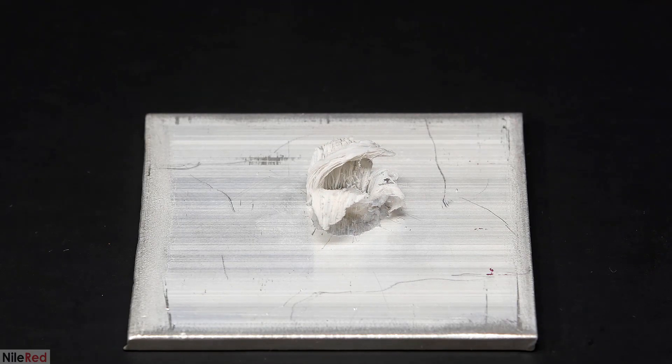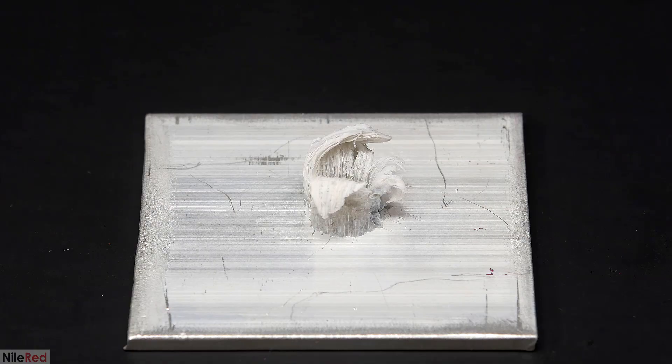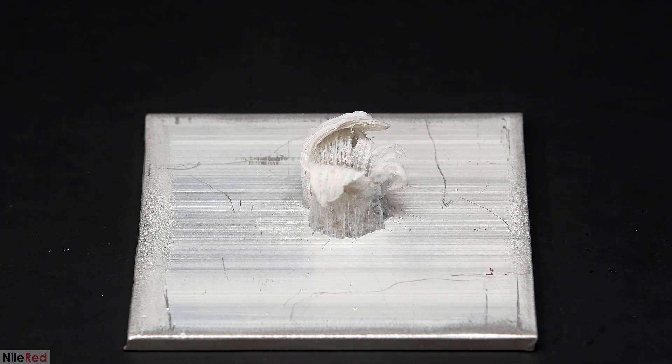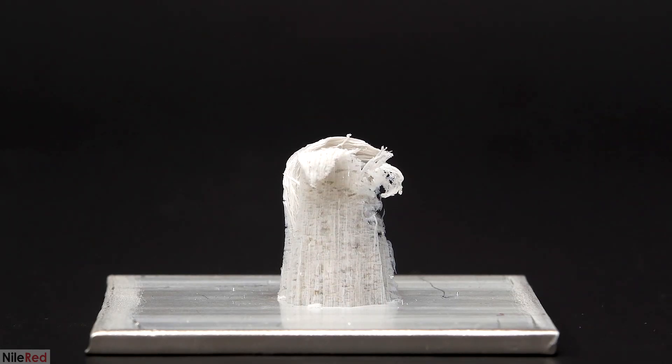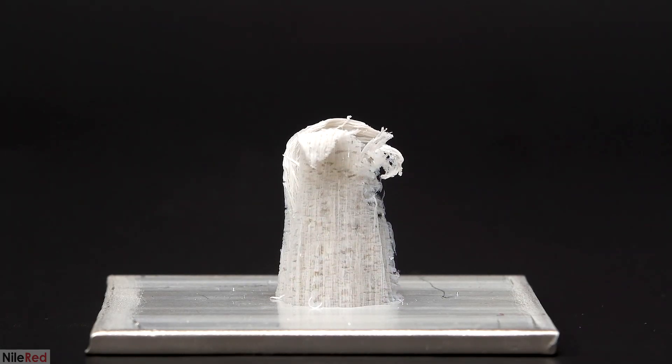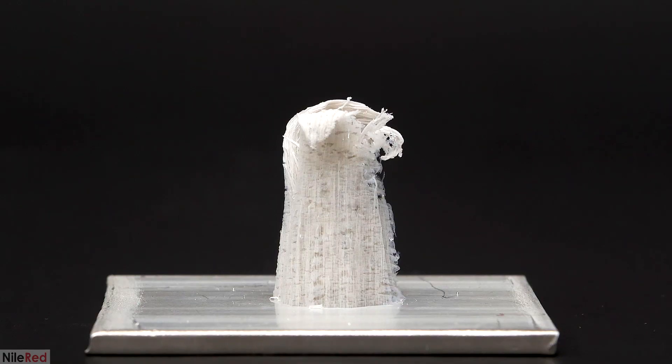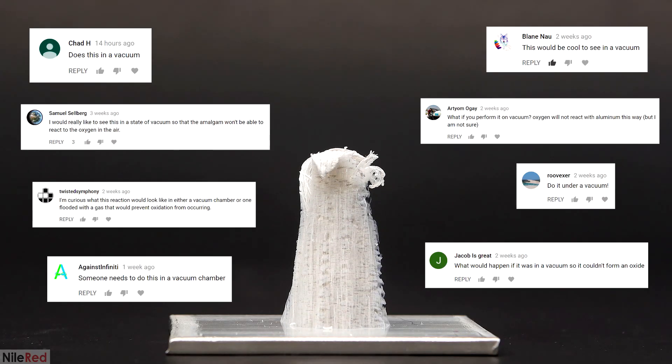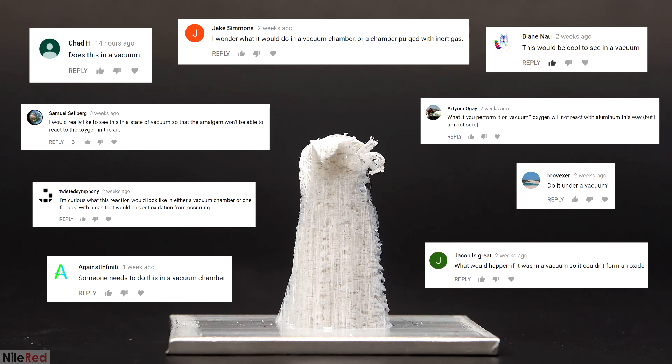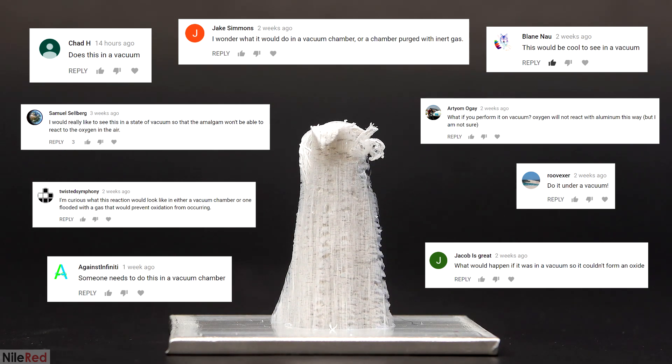Anyway, in the comments of the original video, a lot of you told me that I pronounced aluminum wrong, but there were some of you who had good suggestions. The tower that's growing is made of aluminum oxide which forms as the mercury exposes fresh aluminum to the air. So a bunch of you asked what would happen if the air is removed and there's no oxygen to react with the aluminum?